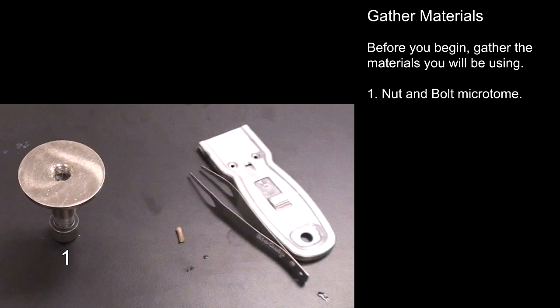The nut and bolt microtome, a 1 centimeter length of plant tissue, a set of tweezers, and a razor blade in its holder.